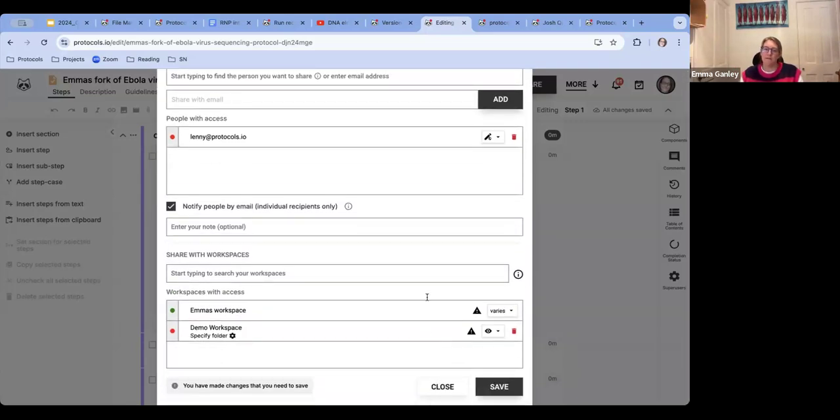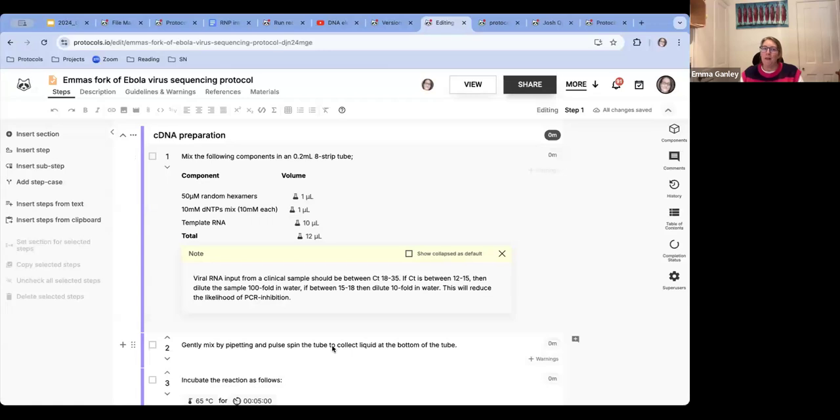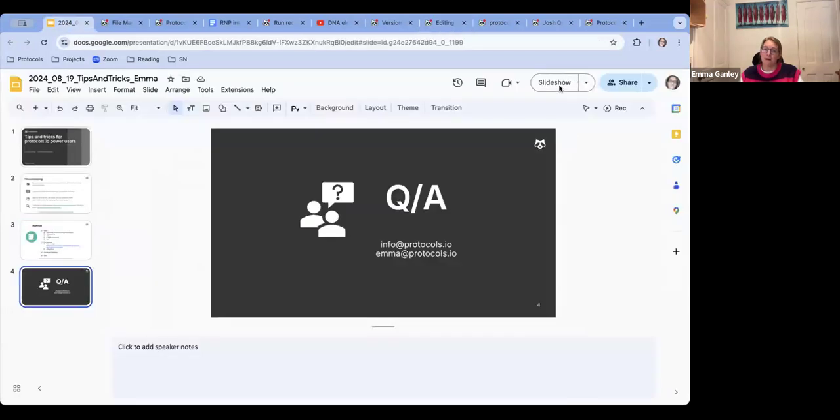So I won't save that, so I won't trigger emails to people. Those are all of the main functionalities I was going to run through. And I can stop now for some Q&A. We've still got about 10 minutes left. And I will take questions, and I can see that one just popped in to the chat already.